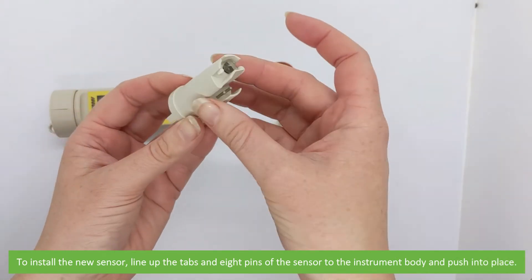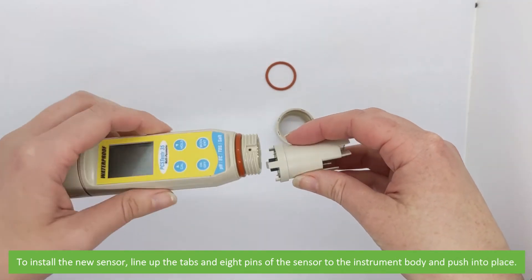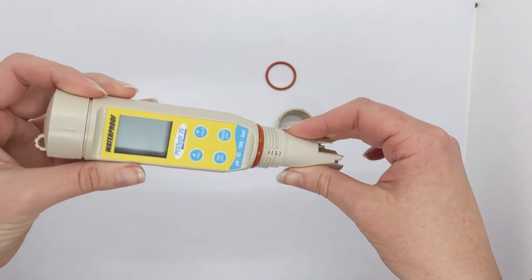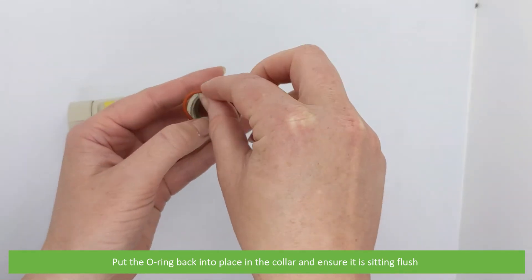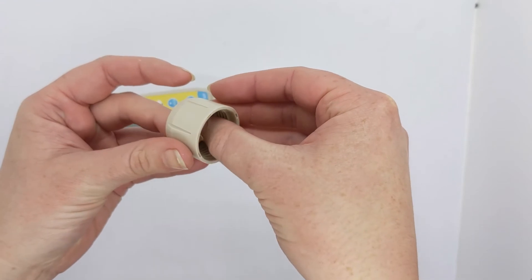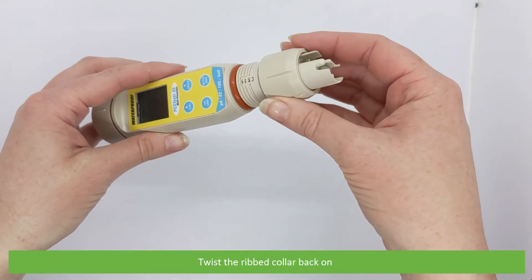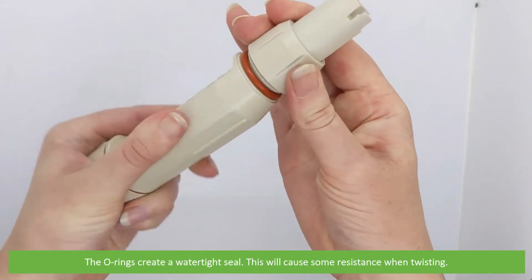To install the new sensor, line up the tabs and the eight pins of the sensor, then push the sensor into place. Put the o-ring back into place in the collar and ensure it is sitting flush. Then twist the ribbed collar back on. The o-rings create a watertight seal, so it will cause some resistance when twisting.